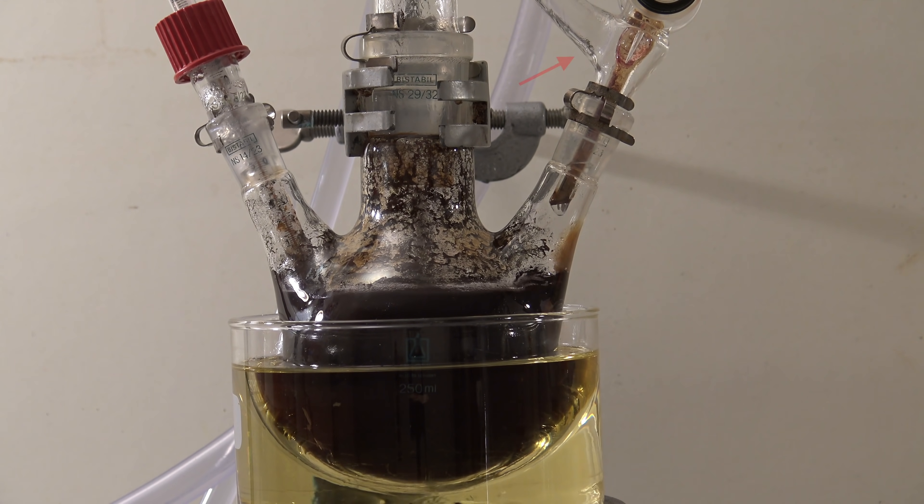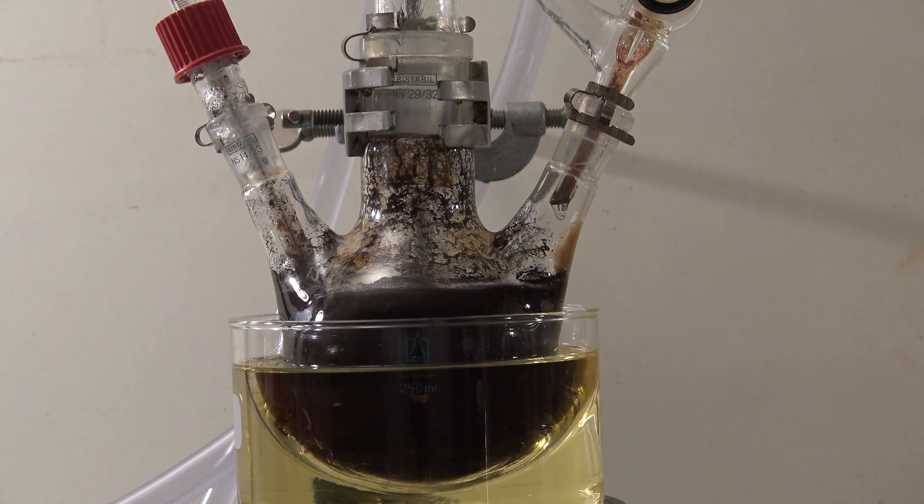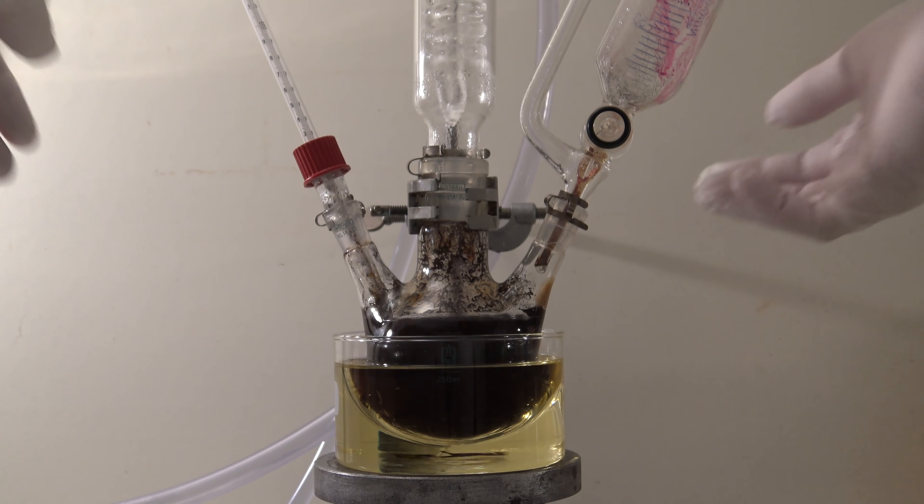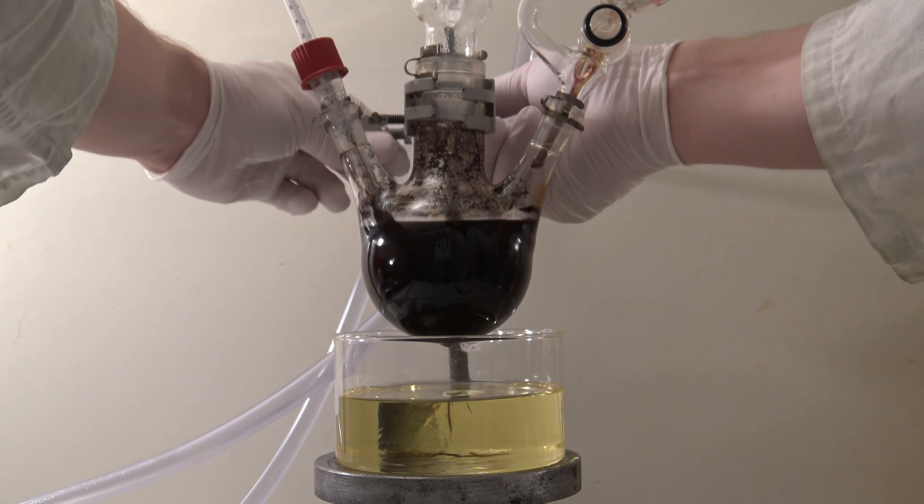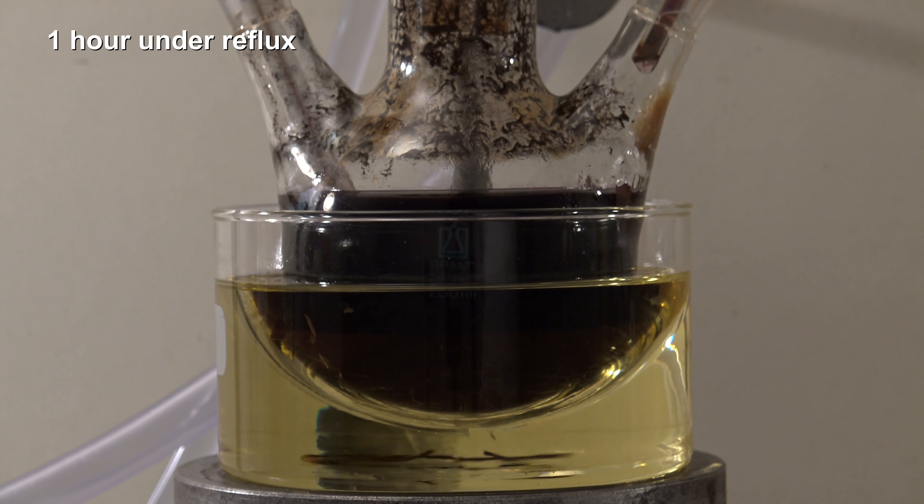After 1.5 hours, it could be seen that the condensate did contain significant amounts of toluene. To check if permanganate was still present, the flask was removed from the oil bath. The manganese dioxide settled at the bottom and it could be seen that permanganate was still present.